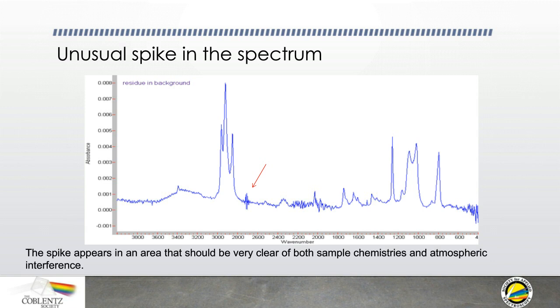All right. We'll still take two questions here. A question from Mark asks, what can cause the transmittance level to be greater than 100%? And the other question is, can that be a real number if it's more than 100%? Can it be a real number? No. What can cause it?